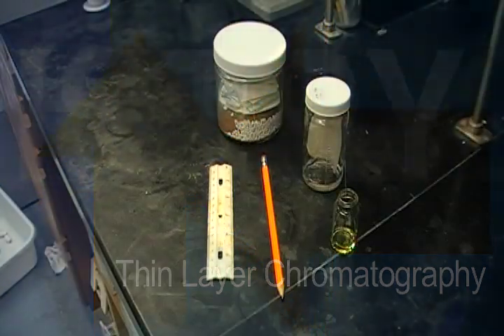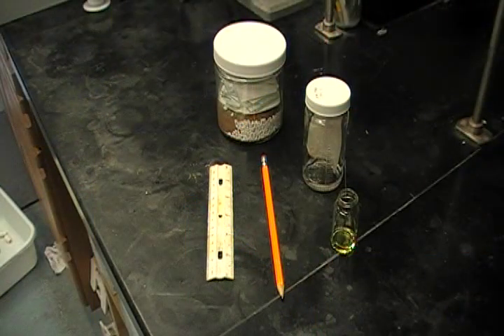Thin-layer chromatography, also known as TLC, is a common analytical technique used in chemistry. It can be used to determine the purity of a sample, analyze the components of a mixture, or monitor reactions and purifications.